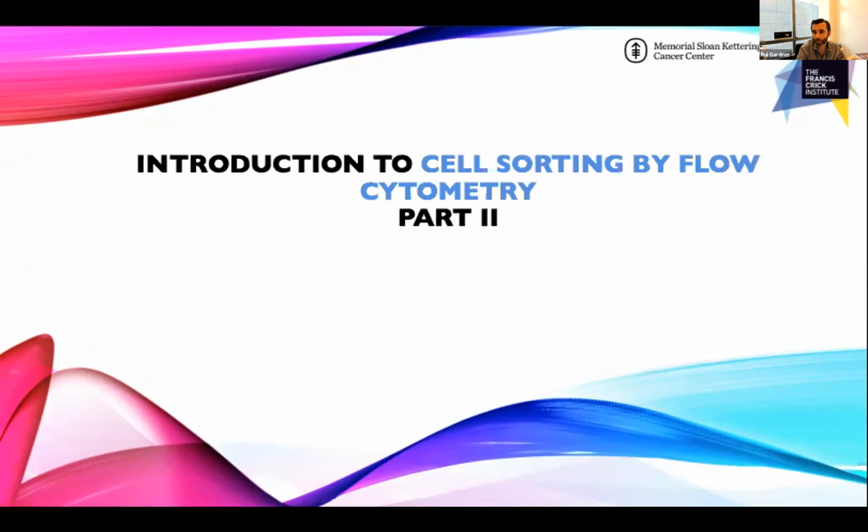Today we're going to follow up on the last remote class that we had on cell sorting. So we're going to go a little bit into more depth with some of the processes to set up the sorter, and maybe go through some of the troubleshooting that we typically do in cell sorting.